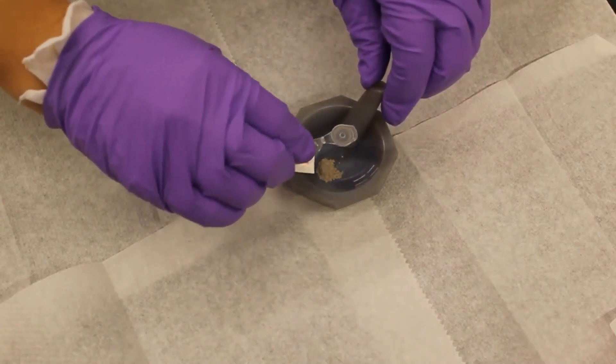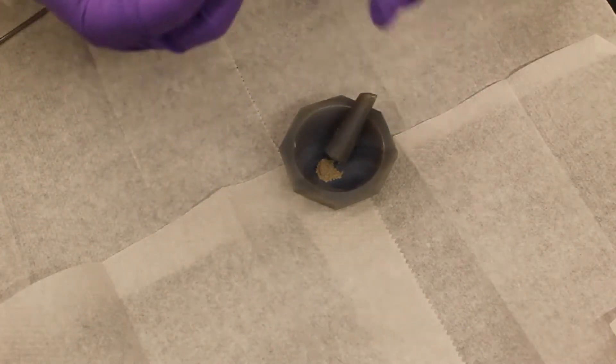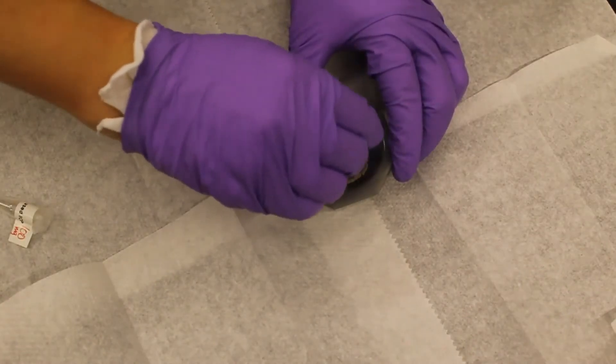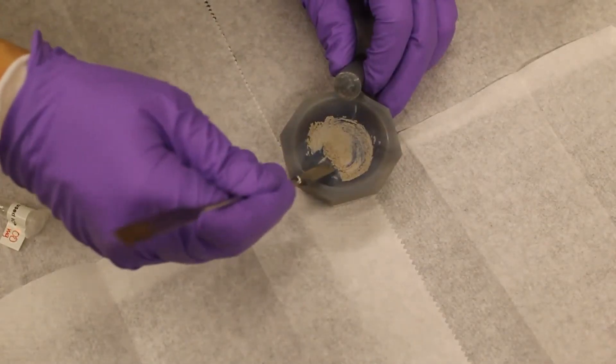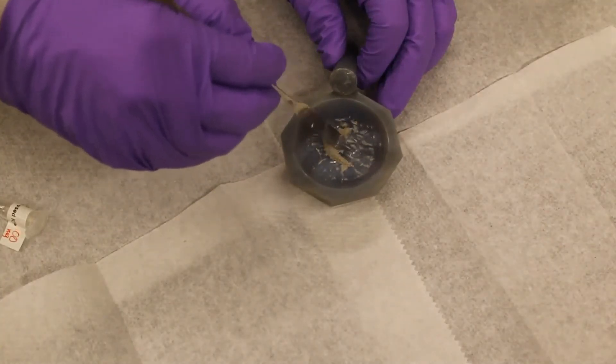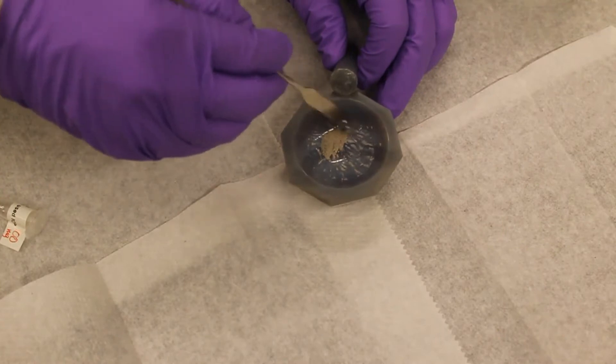First, we're going to grind the catalyst sample. We put about a 50 to 100 milligram sample into mortar and pestle and grind it for 3 to 5 minutes. We grind this one a little bit longer than usual because we want to get a fine catalyst powder.